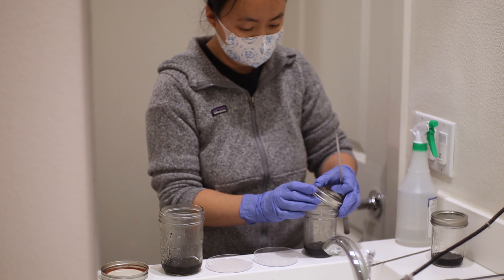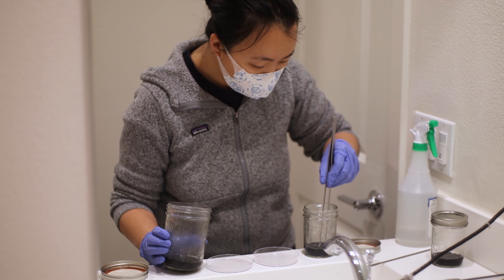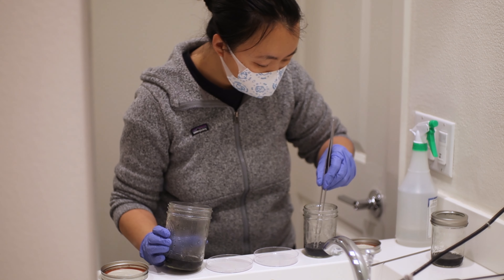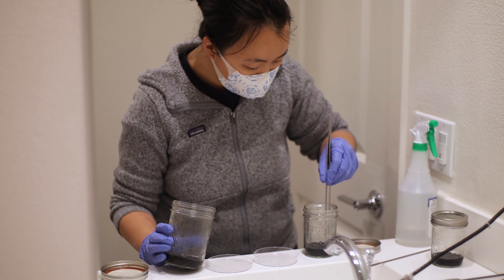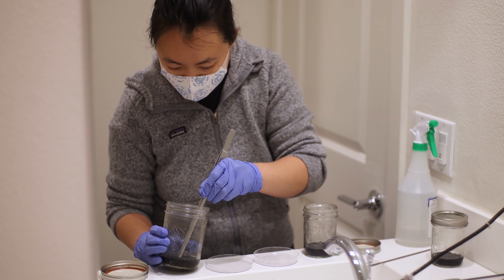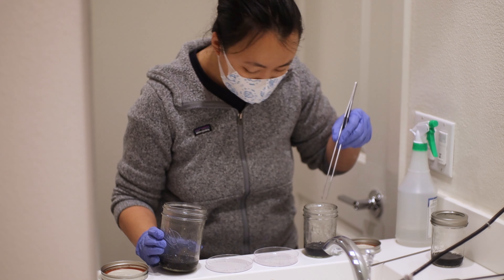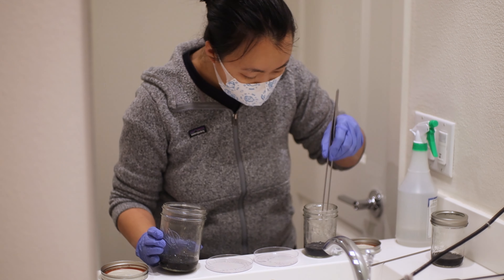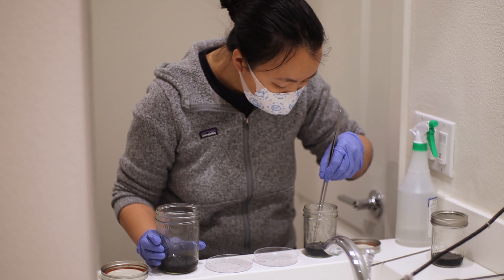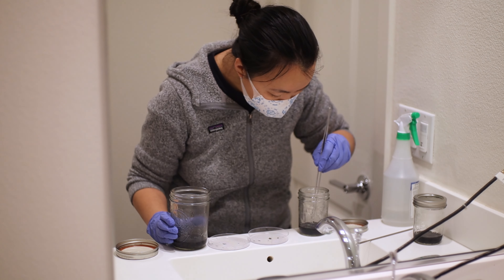For replates, you really need a couple of things: a clean workspace, your mother flask, your daughter flasks with more nutrient-dense media, and a couple of tools like tweezers or a scoop, and also rubbing alcohol on hand. Basically, what we're going to do is open the top of the mother flask and either use tweezers or a scoop to take out all of those seedlings to thin it out and put them in a new jar.